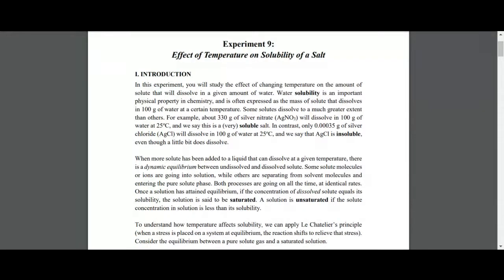With the 25 grams, it would still dissolve. If you add 34 grams of sodium chloride to 100 grams of water at room temperature, it's going to dissolve. So you still get a solution.